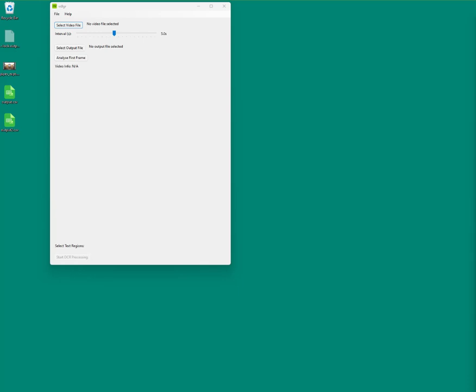This is vdlgr. It's an app with a very specific purpose. I've worked in both science and engineering, and a lot of the experiments that I've been part of have involved collecting data over some time period. So collecting temperature every 5 seconds, 10 seconds, minute, collecting changes in mass or weight, or what's the voltage at any given time.